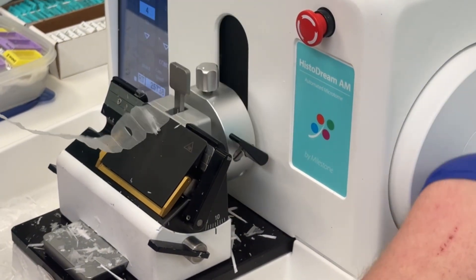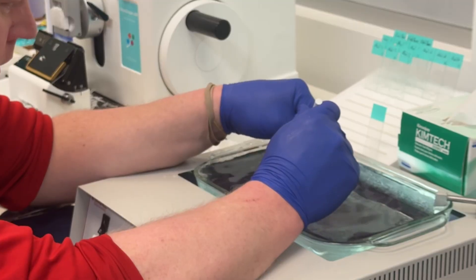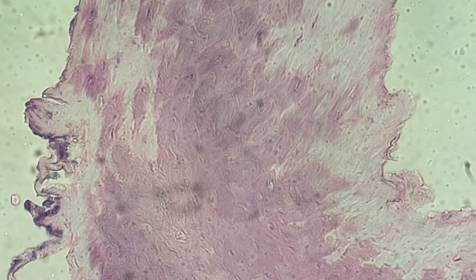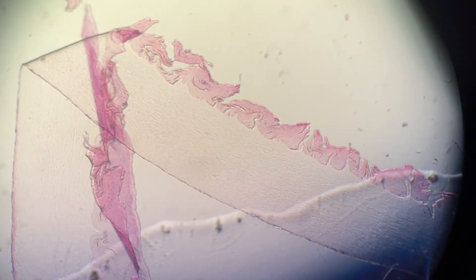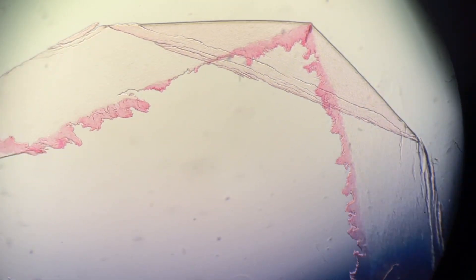So there you have it — out of the four options we tested, Nair gave us the best results. Here's a look at the nail specimens under the microscope after staining. Come back for Part 2, where we'll test other softening solutions like hand soap and laundry detergent. And if you have a suggestion you'd like to see tested, leave it in the comments.